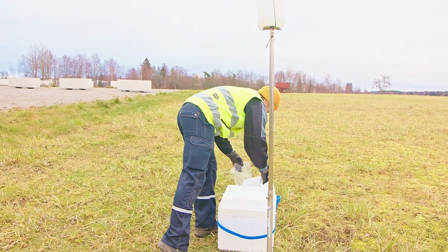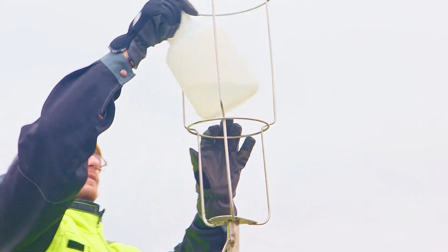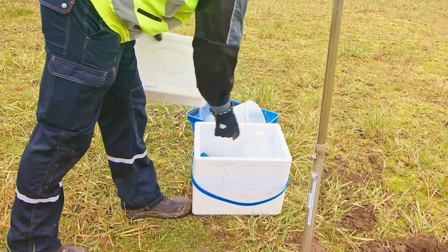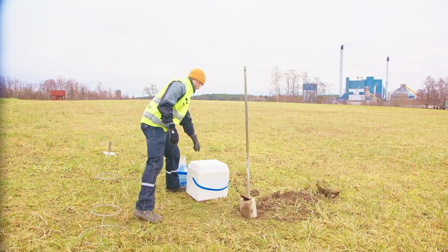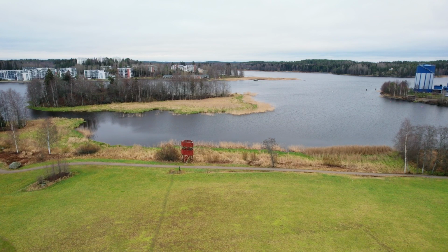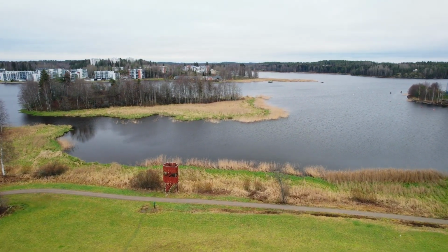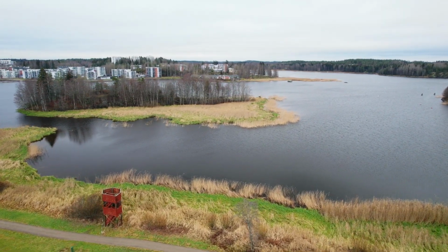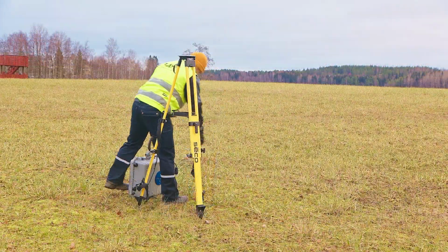A single collection period usually lasts for no more than 1 month, after which the deposition collectors are removed. The sample container is closed immediately after removing it from the collector. The sample container can then be transported securely to a laboratory for processing and analysis. The results should be calculated using a calculation method suitable for the type of collector. The collection efficiency of different deposition collectors may vary, so the results of different collectors may not be comparable. The pollutants that are studied also influence the method to be used.